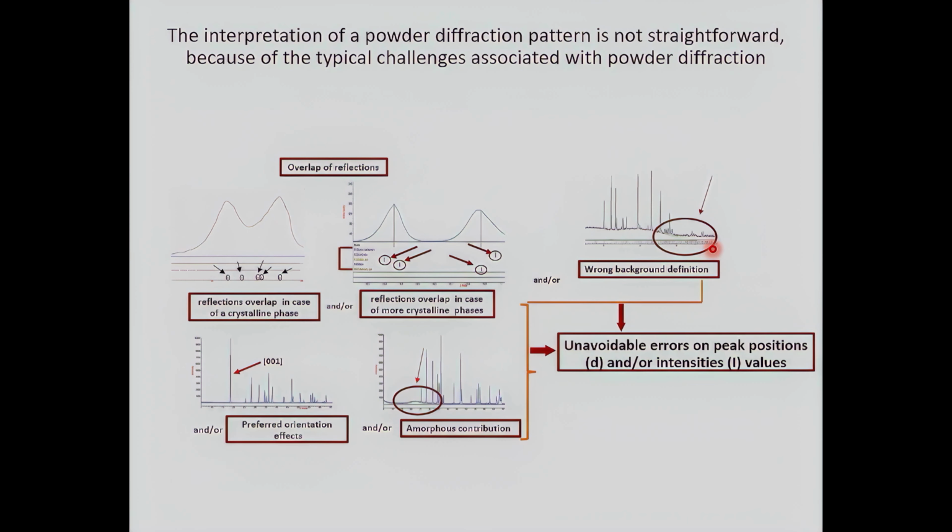As a result of the diffraction, we collect some very intense peaks, and these modify the relation between the peaks inside your pattern. Another problem can be the presence of amorphous material. As I said, the amorphous component gives a scattering diffraction and a bump in your diffraction pattern.